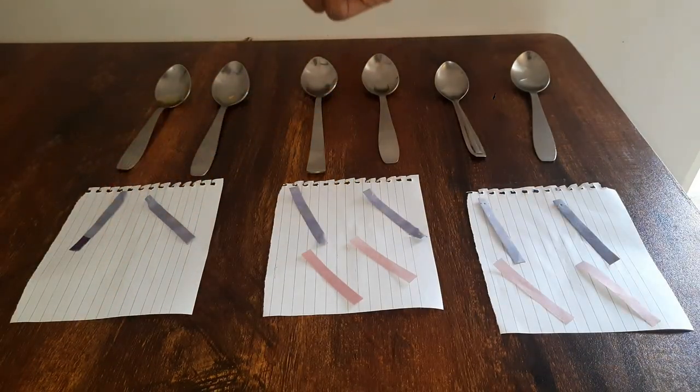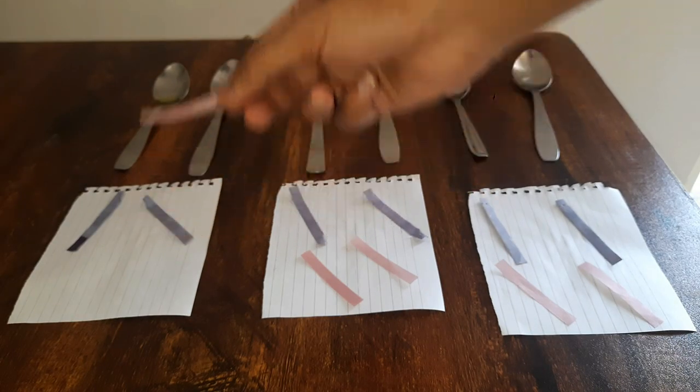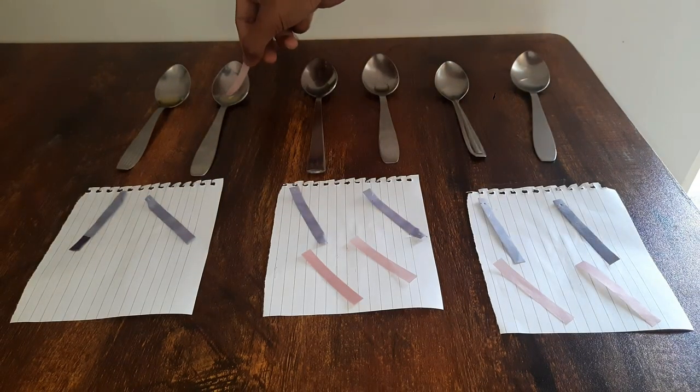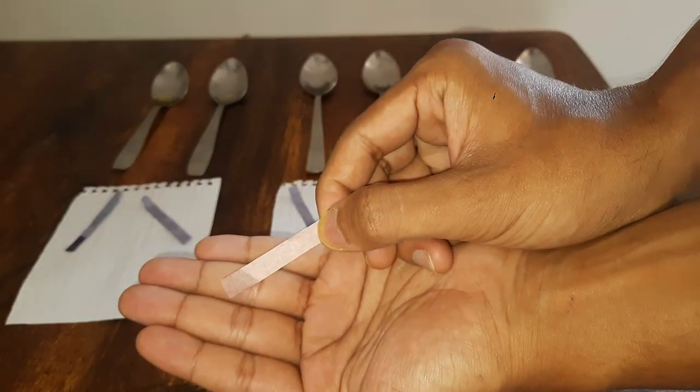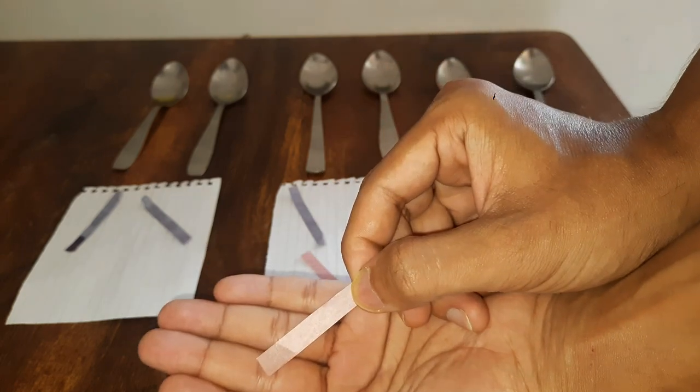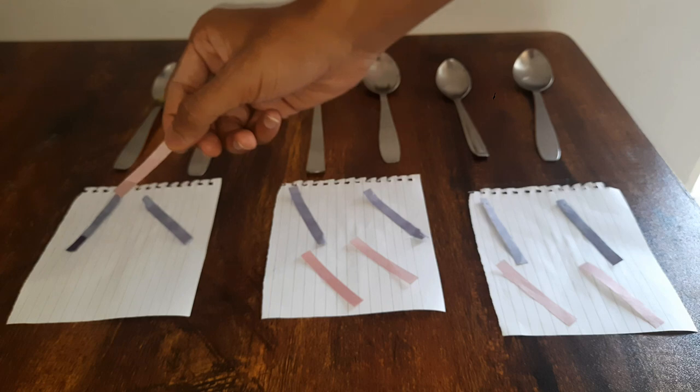Now let's move on to the lemon juice. I have the red litmus paper. Again, there is no color change, which tells us that lemon juice might be acidic.